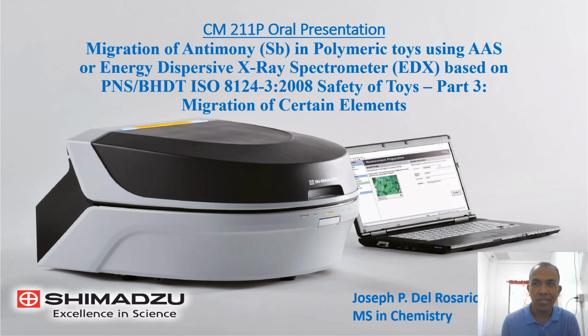We have planned this way back in 2018, but unfortunately the project didn't push through. So I chose this because hindi pa to validated sa office namin. And this might give an insight or idea before we push this in our lab to get verified or validated.